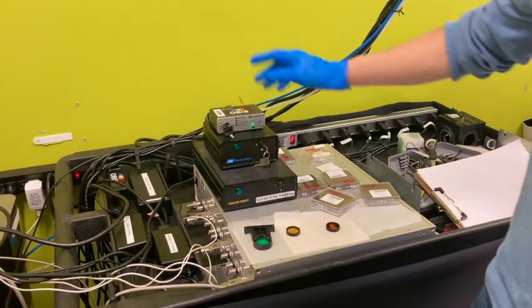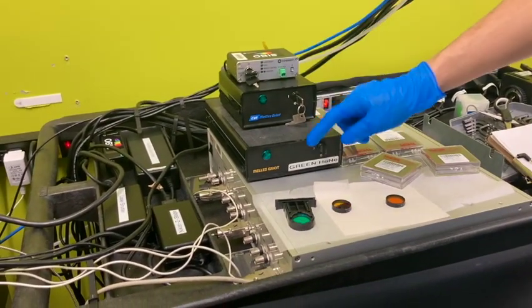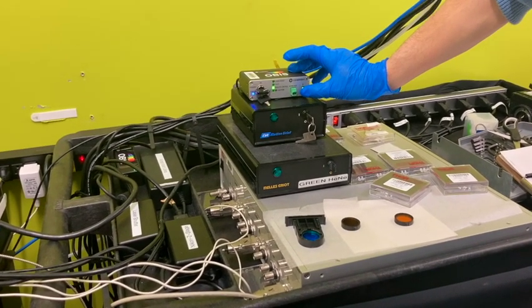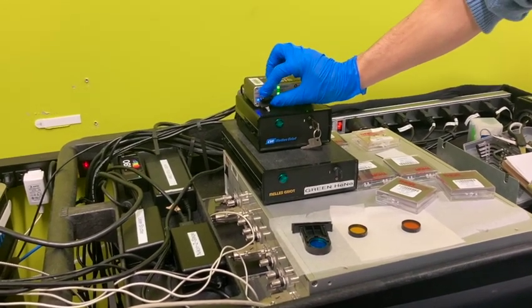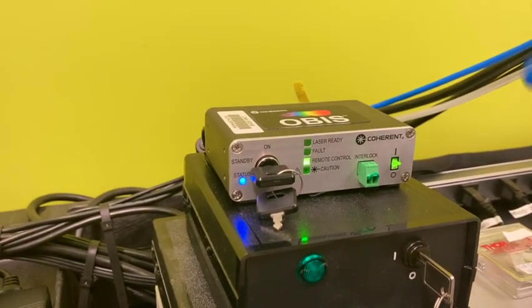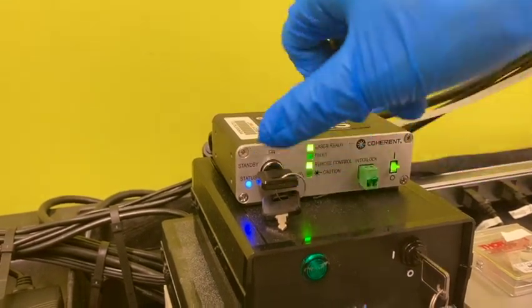And we have this blue, red, and green laser. This is the switch for the blue, you turn it on. But you need to make sure this key is turned to the standby mode here. And you need to wait for 2 or 3 minutes until they stop blinking, and then you can turn it on.